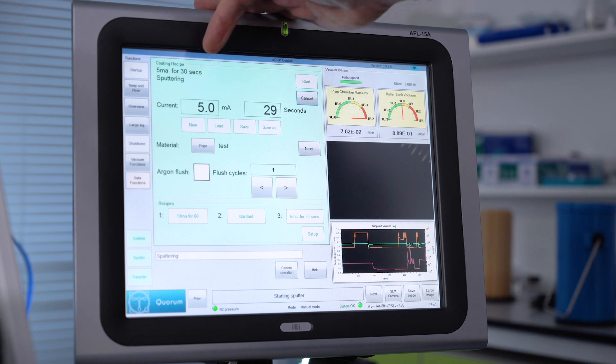And now the argon pressure has reached the right value. We can see now it has struck the plasma and we're now beginning to count down for the coating.